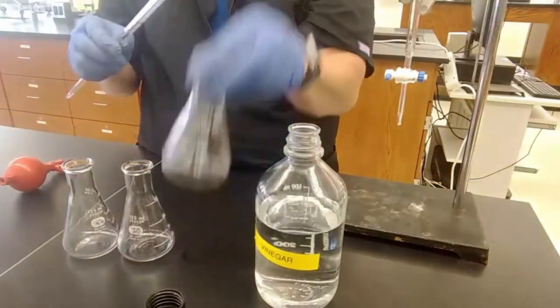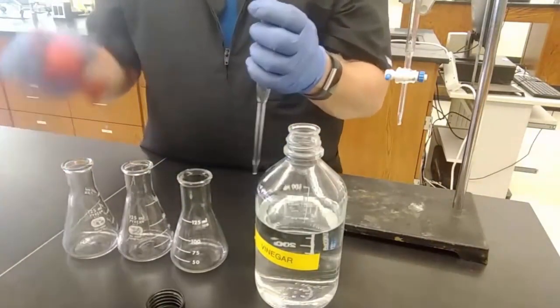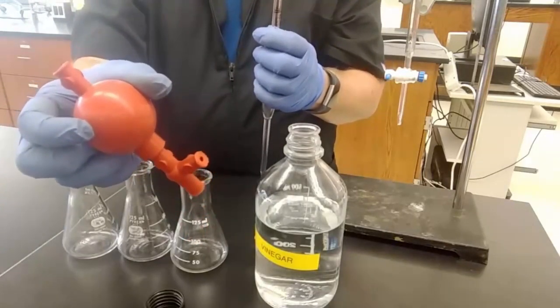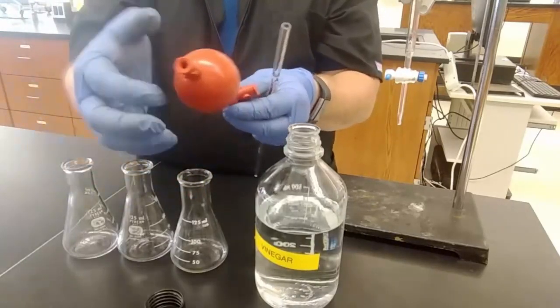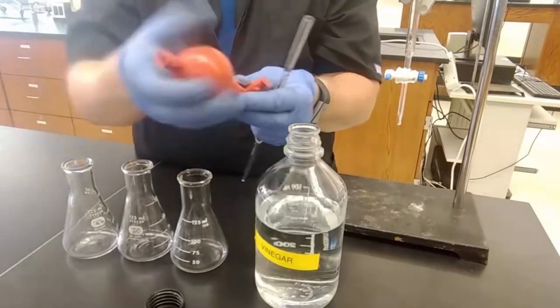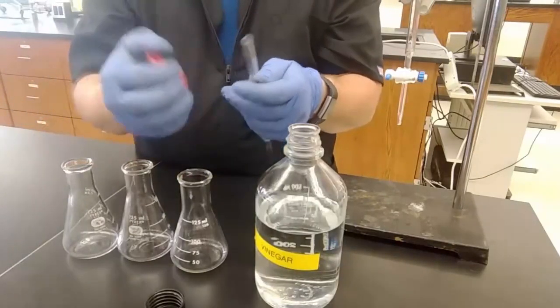We can't just pour 10 milliliters into here. It's not going to work. So the way that we do it is to use a pipette bulb, and these things can get destroyed very easily from people not knowing how to use them properly. It's relatively straightforward to use. The old school ones had no valves on them, and that's what breaks on these. It was just a rubber bulb, and you squeezed it to blow the air out of it, and then it would suck stuff up in it.